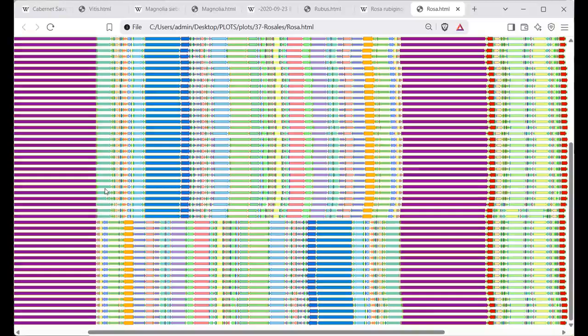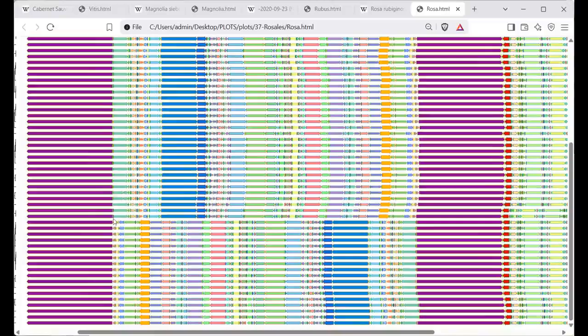What is happening here is that it's well known that plastid sequences are present in all plants in two isoforms. In one isoform, the long or short single copy region is inverted with respect to the rest, and they remain in about a 50-50 mixture.